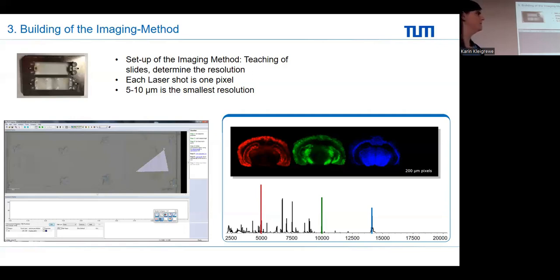You, for example, show it in red, and then when you click on this, it's distributed like that, and then you can merge it together and look at what is present in your data. When I did my postdoc in San Diego, I just did it with this software, and it was horrible and tedious, and it was not really much fun because it took so much time to finally find something interesting.